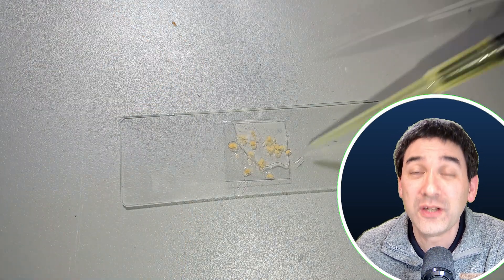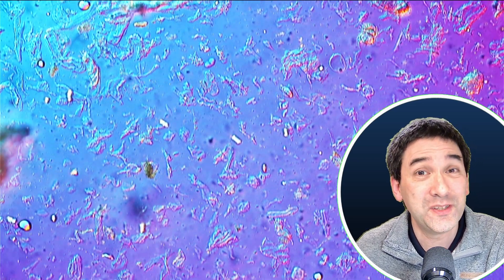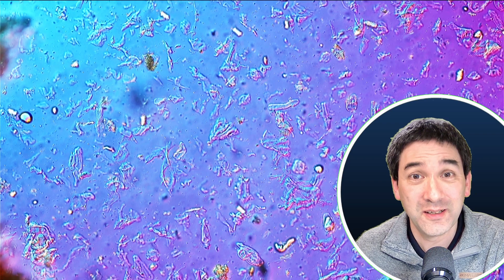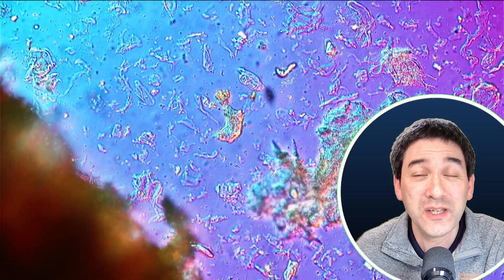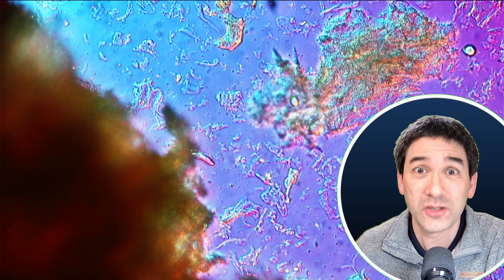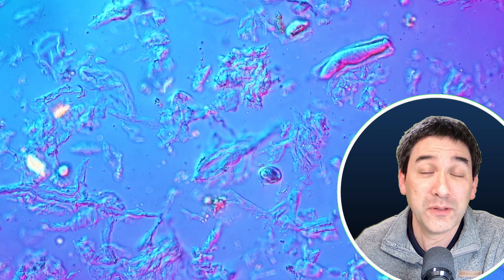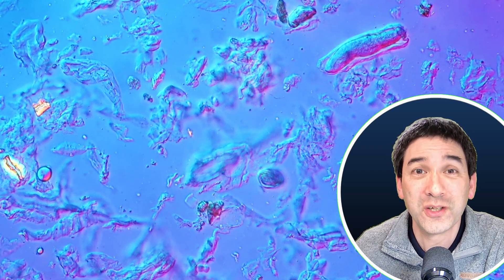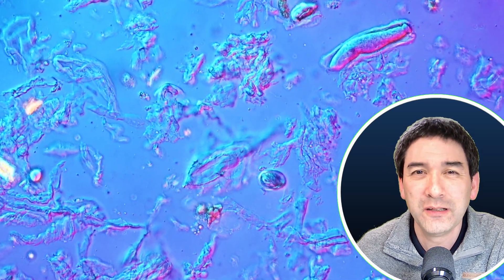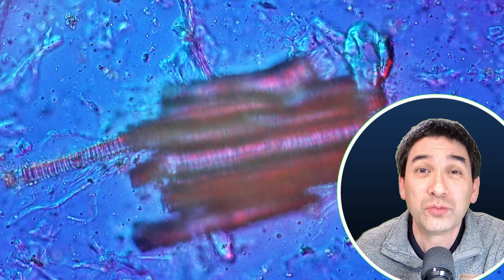I already knew that vegan meat is made in most cases of soy products, but I did not see any plant cells in here. A little bit to my surprise, I expected to see at least some plant material, but all I saw was a mess actually. There were fragments of I don't know what, and there were actually no recognizable structures that I was able to find, which was a little bit of a disappointment because at least I was hoping to find something that I could recognize.